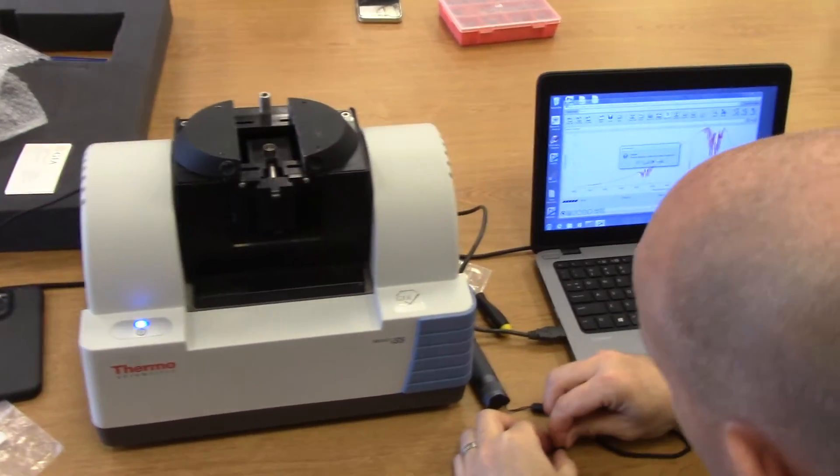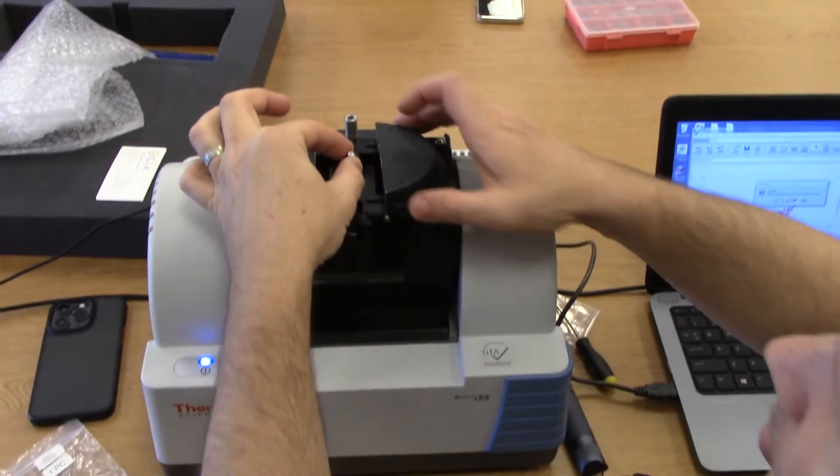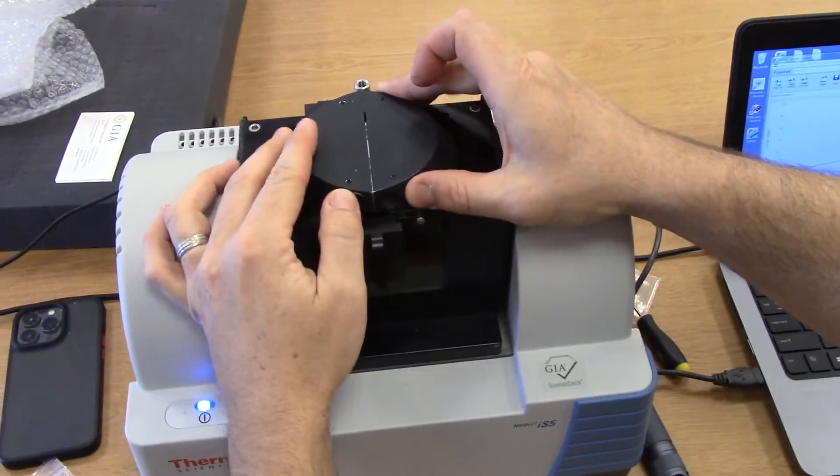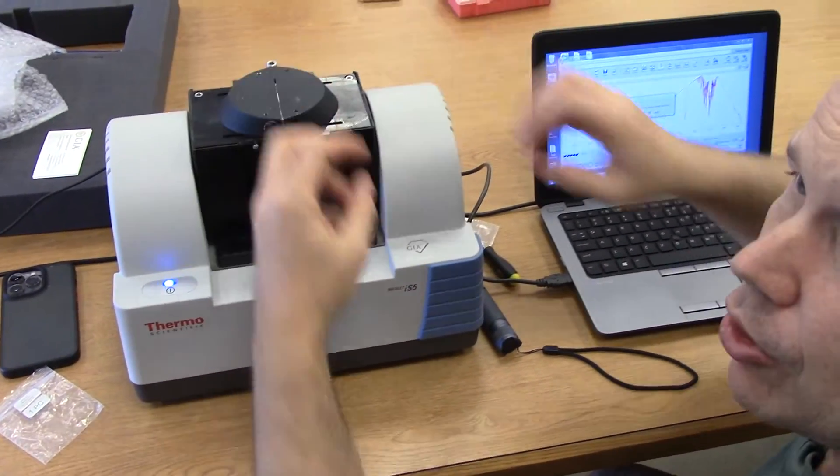He has a very high proportion in his collection. For your purposes we might have to put a better catch to make sure, but even if they drop to the bottom it's not lost. It's completely enclosed.